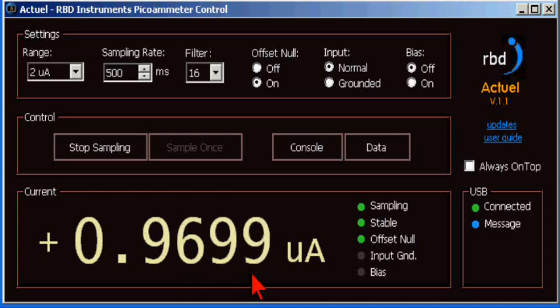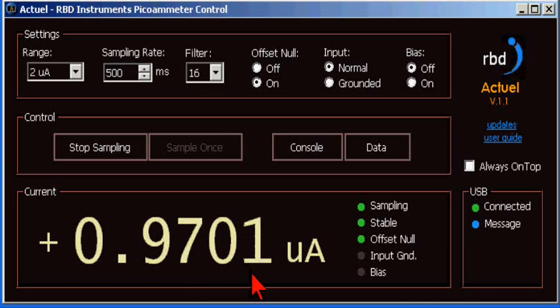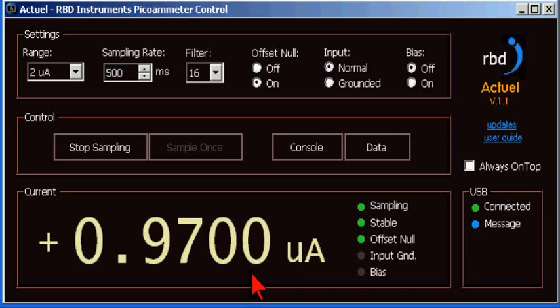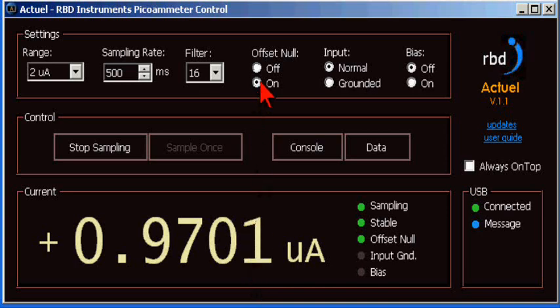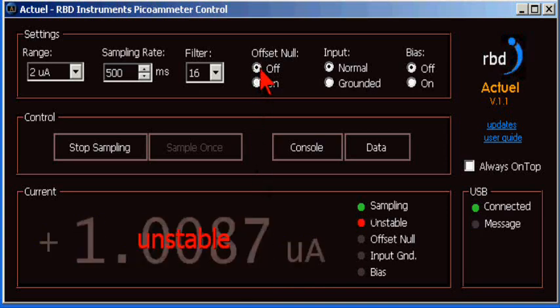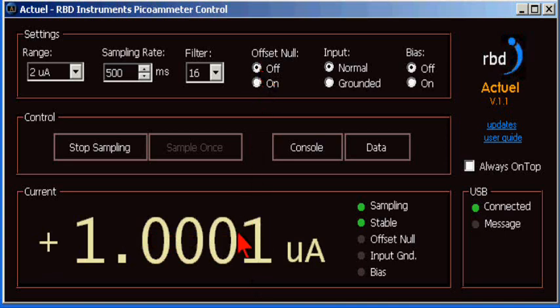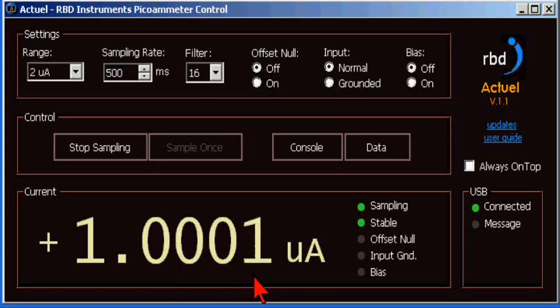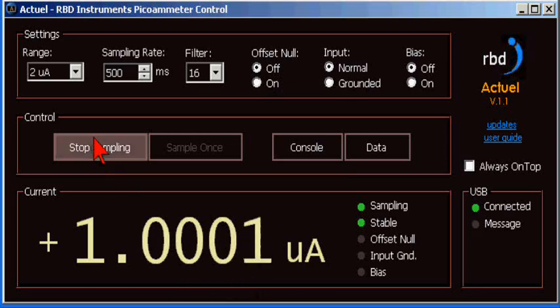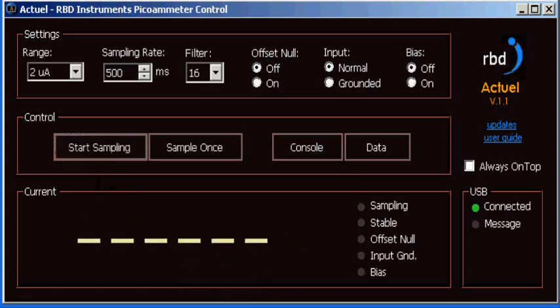If I turn the offset back off, now the reading will come back to where we expect it to be. So, this allows you to reduce the error in your measurements by taking out any small leakage current that you may have in your setup.